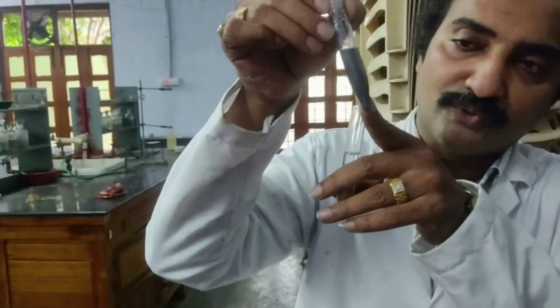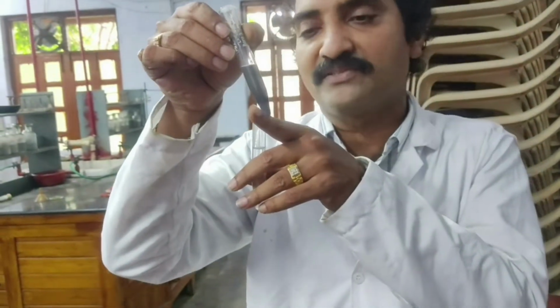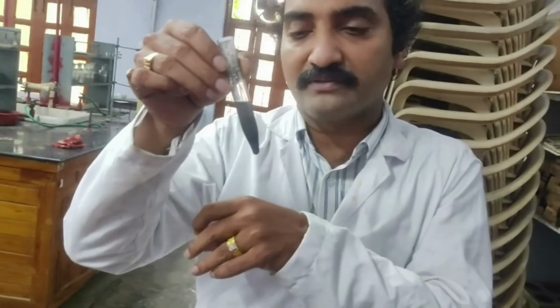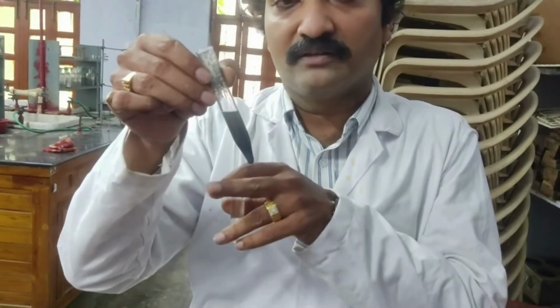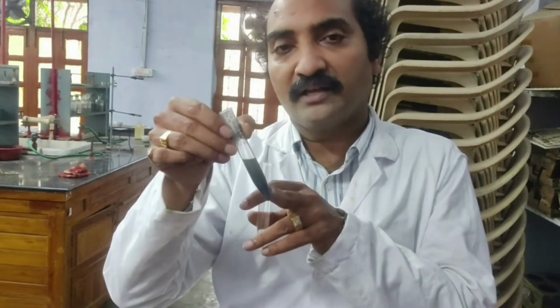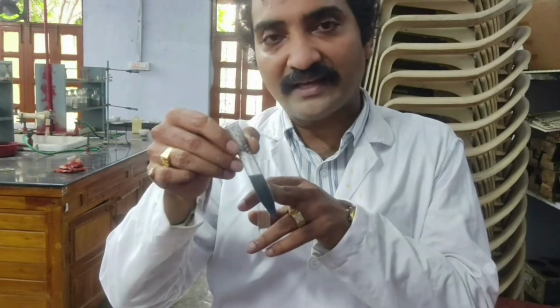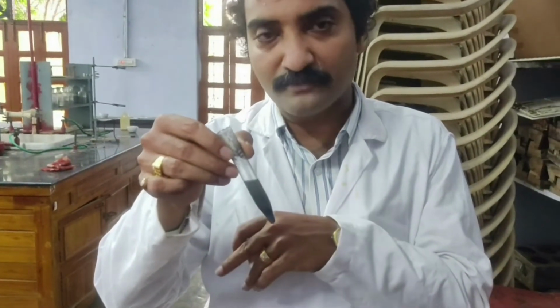This residue, which is black in color, indicates the presence of cobalt or nickel. But as per the syllabus, we don't have cobalt. Therefore, this black residue is indicating the presence of Ni+2. Now the centrifugate contains other cations of this group, namely Mn+2 and Zn+2.